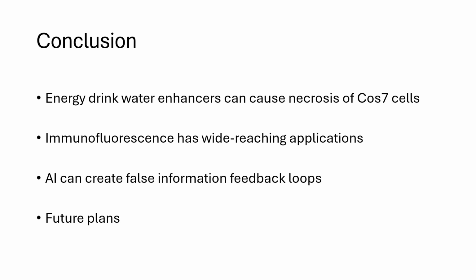Looking ahead, I'd love to test isolated compounds like caffeine and nicotinamide individually and in combination to better understand their roles in cell viability.